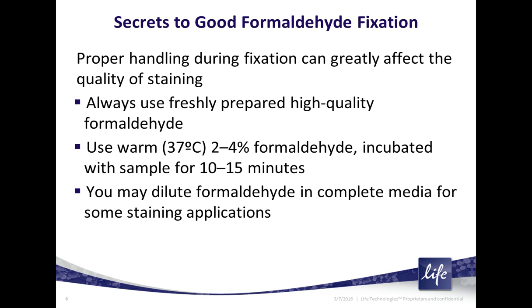Most fixation methods require the formaldehyde fixation, to answer one of the questions. And as far as what you do the fixative in, some people will use PBS. I generally recommend using complete media because it's better for the cells.